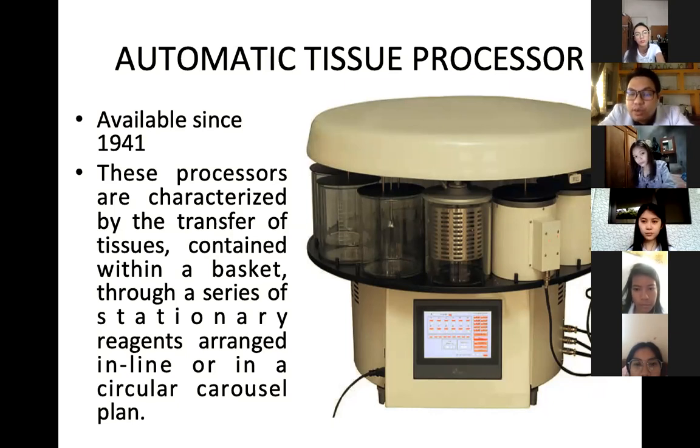Okay, those different types of containers, class, contain different types of reagents. See? So from fixation until embedding, yung reagent na nakalagay dyan. So, ano ang piniperform nito? Basically, class, Auto-Technicon performs histotechnique.